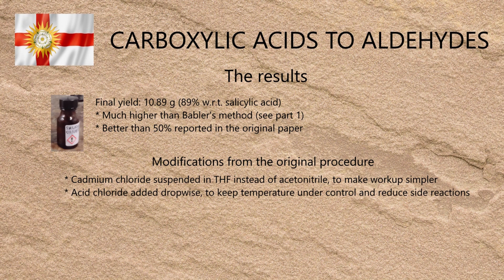In the original paper, the acid chloride was added all at once. As in part 1, drop-wise addition of the acid chloride in PCE and the use of an ice bath kept the temperature under control and likely reduced the possibility of over-reduction and side reactions.